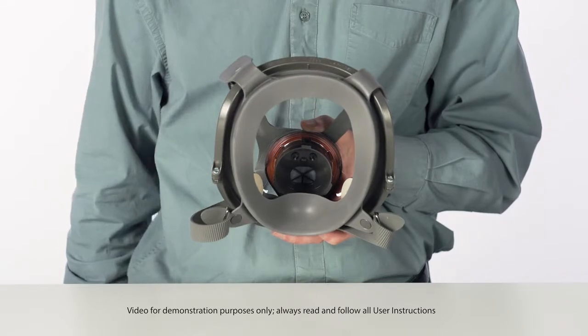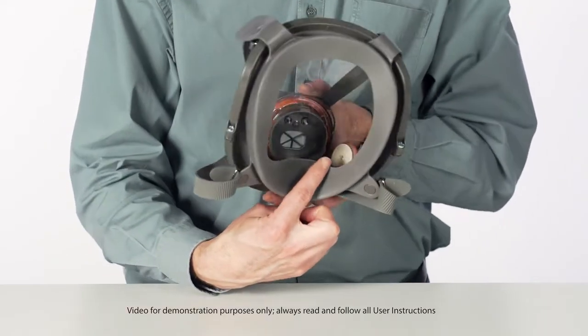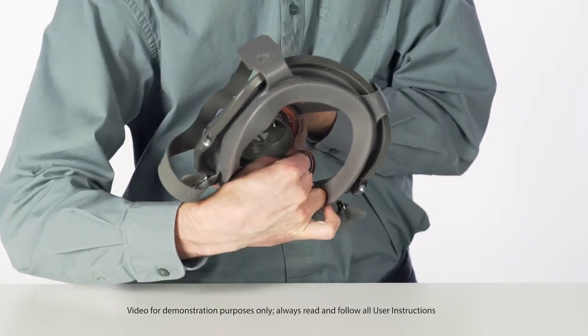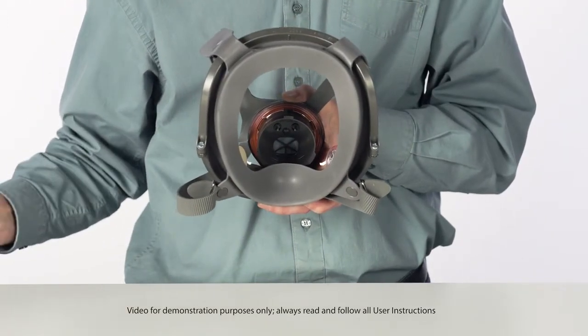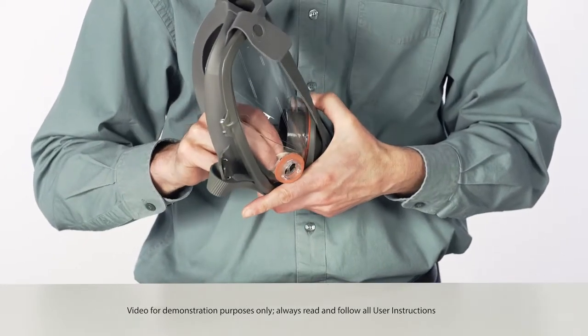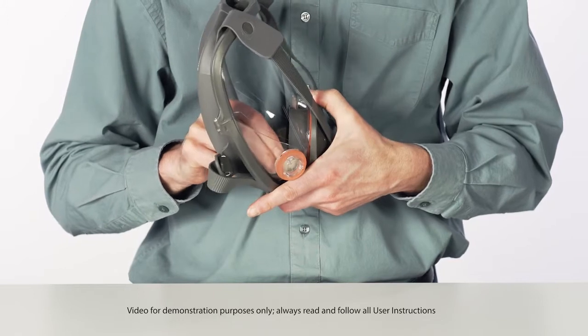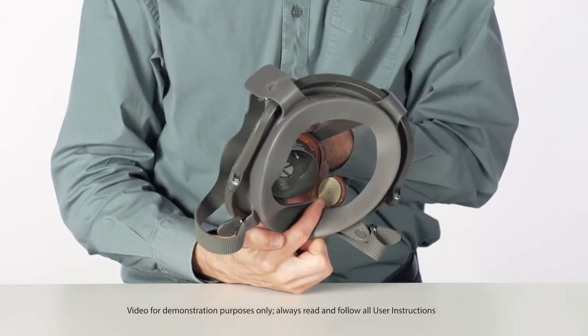Inhalation valves are located inside the nose cup and inside the lens. Remove the existing valve by lifting it from the post. Install a new valve onto the posts. Be certain the valve is fully engaged under all three lugs on the post, lays flat, and spins freely.